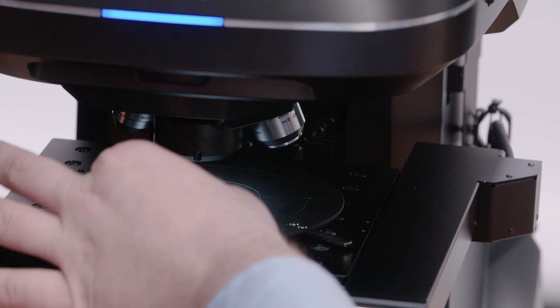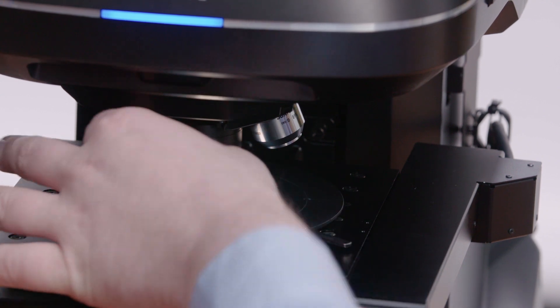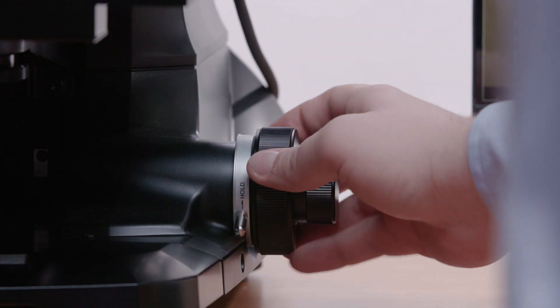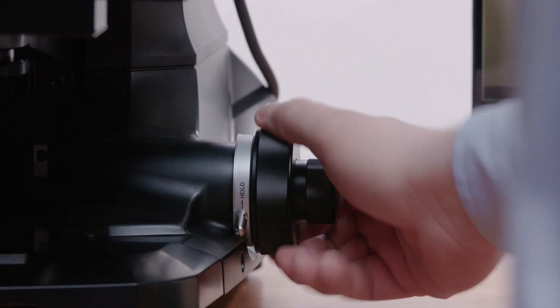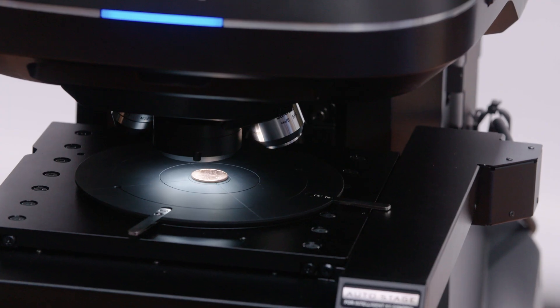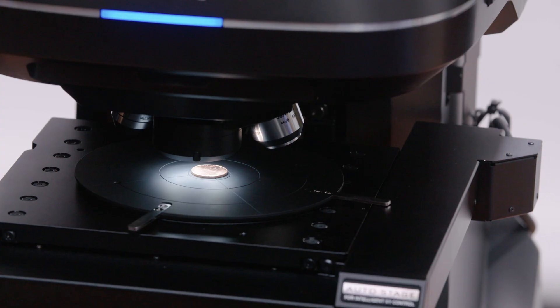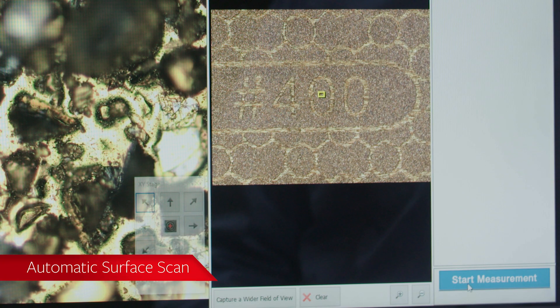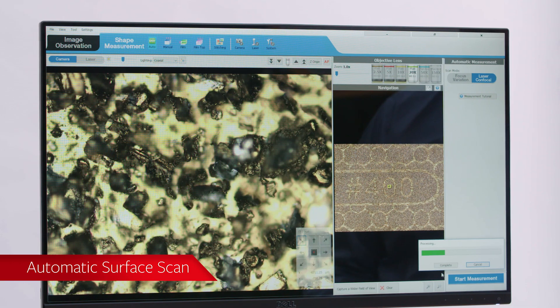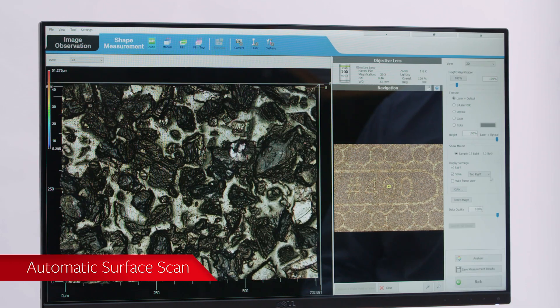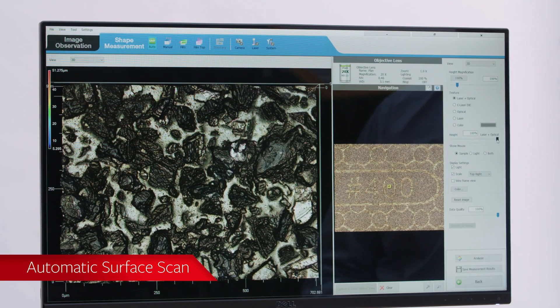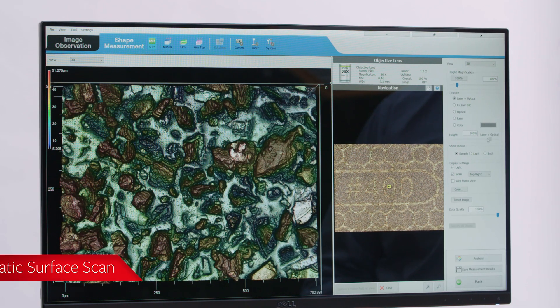Unlike conventional measurement systems that require a user to manually adjust multiple settings before measuring a part, the VKX is able to automatically scan a surface with just the push of a button.